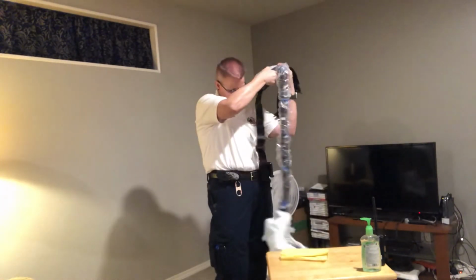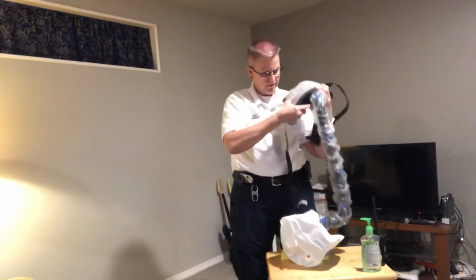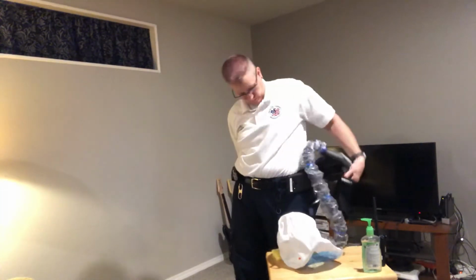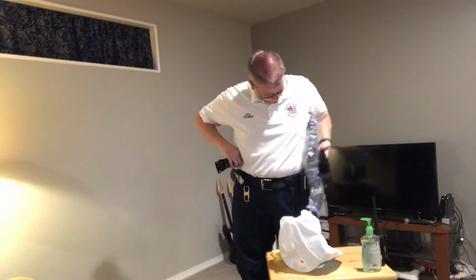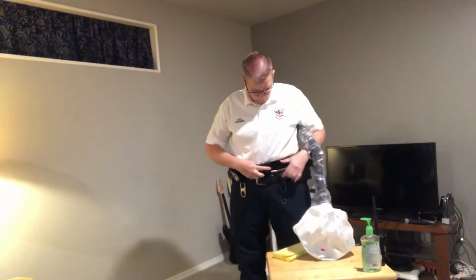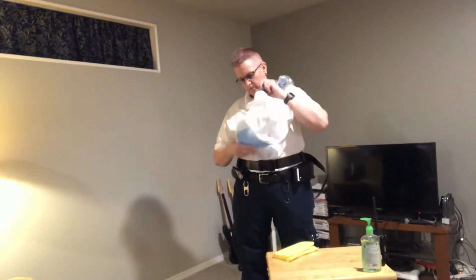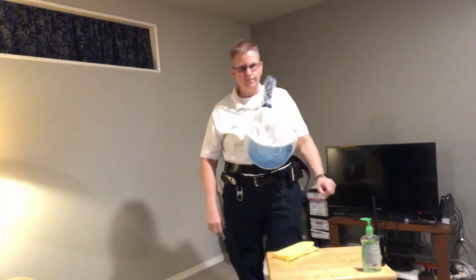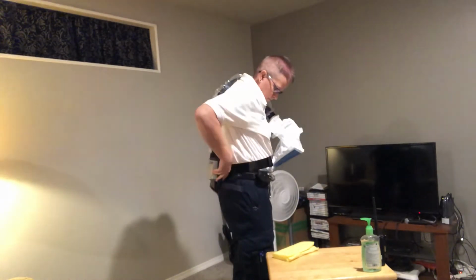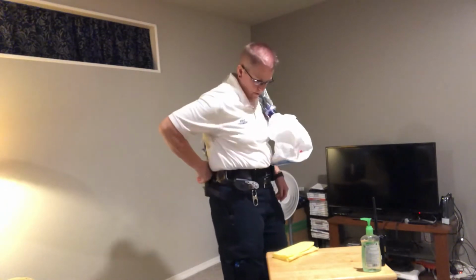So her hoses are hooked up. Now she's going to go ahead and put the PAPR around her waist, the actual unit itself. Just set the hood down anywhere that it's safe to do so. And this is another reason why to empty your dang bat belt here. You can see Jody's doing it a little bit higher up. That's fine, wherever it's going to comfortably fit, where you can have easy access to it. Notice how the PAPR unit itself is slightly to the side, or some people wear it directly behind. She is going to have to access the unit to test it, to check it, to make sure we're good.